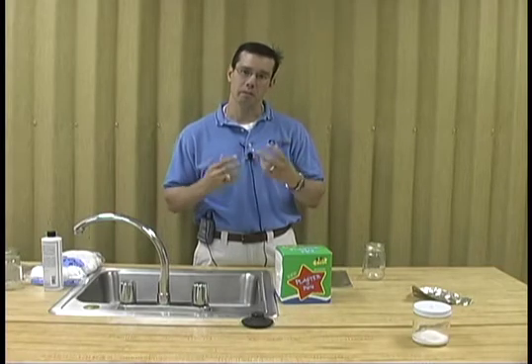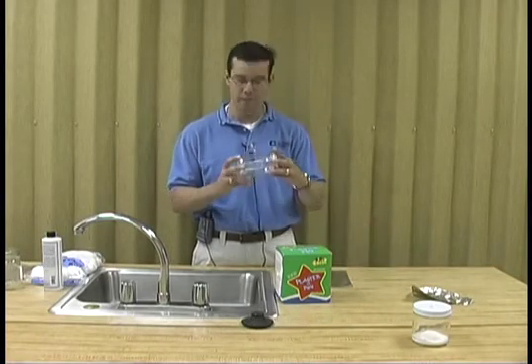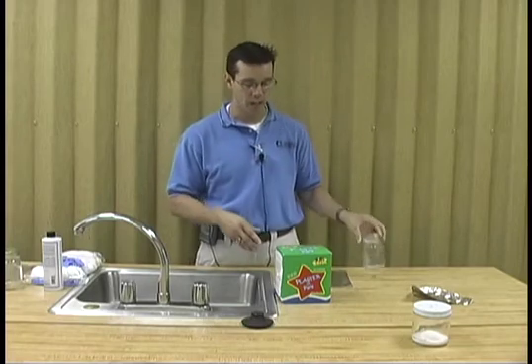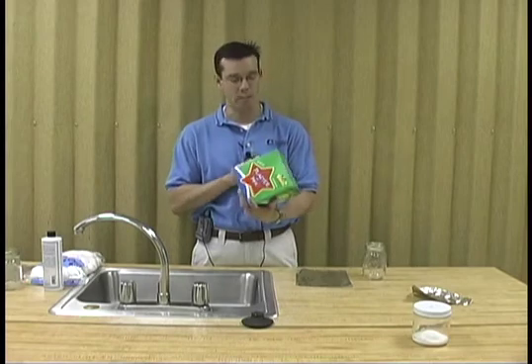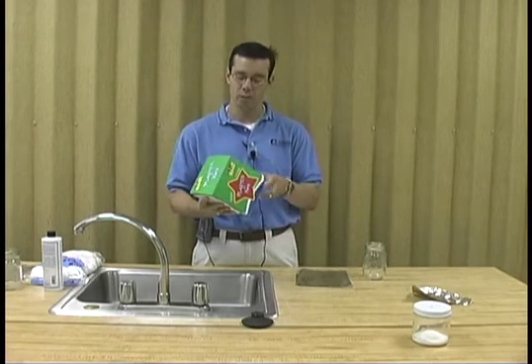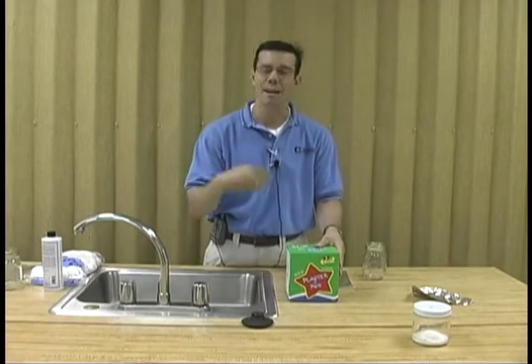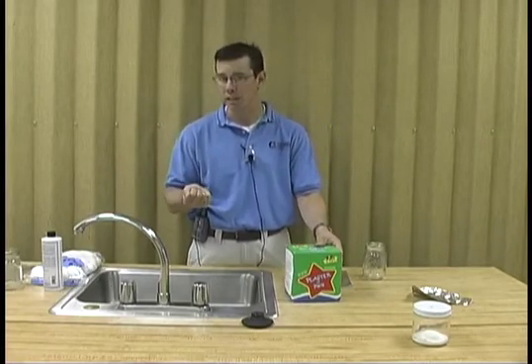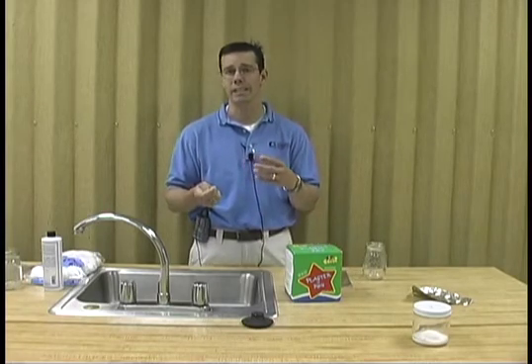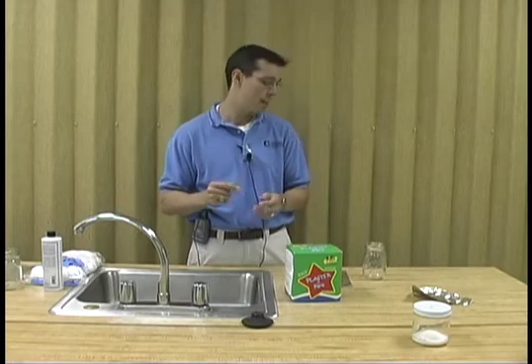A second method that can be employed is the construction of a kill jar. Kill jars are easy to make. All you need is a mason jar, such as you see here, and a Plaster of Paris kit that can be purchased at a retail store. What you want to do is mix your Plaster of Paris and try to mix in maybe a half a handful of sawdust. This will allow the killing agent to permeate the Plaster of Paris once it's dried.